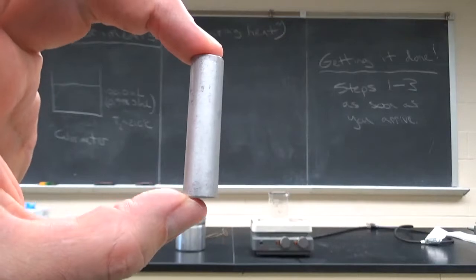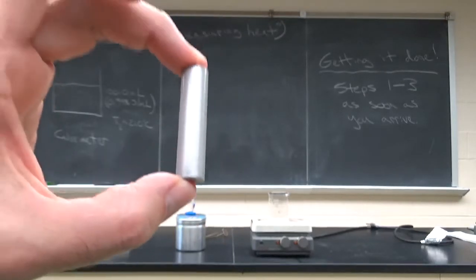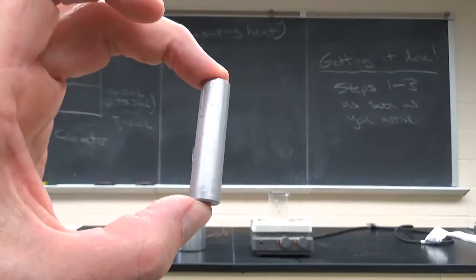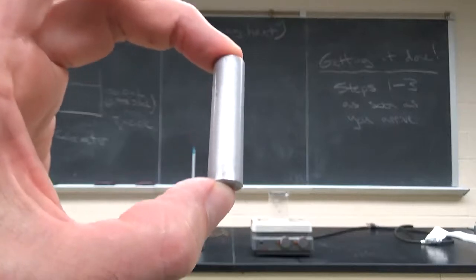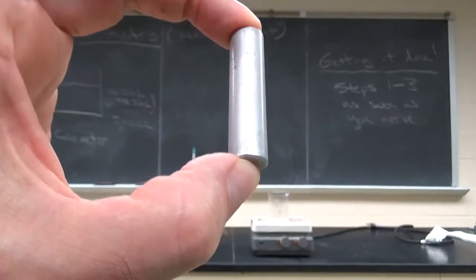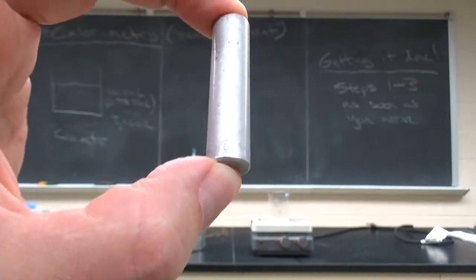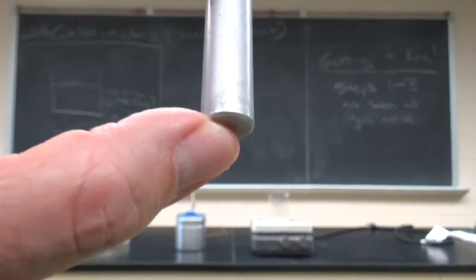And our ultimate goal is to calculate what's called the specific heat capacity, which is a physical property of aluminum, to calculate that using lab data and match it up to what the accepted value is. Kind of like we did for density, but this is using something else. It's a neat experiment, and let's go ahead and review the procedure. Then you can stop the video and then watch the calculations another time.